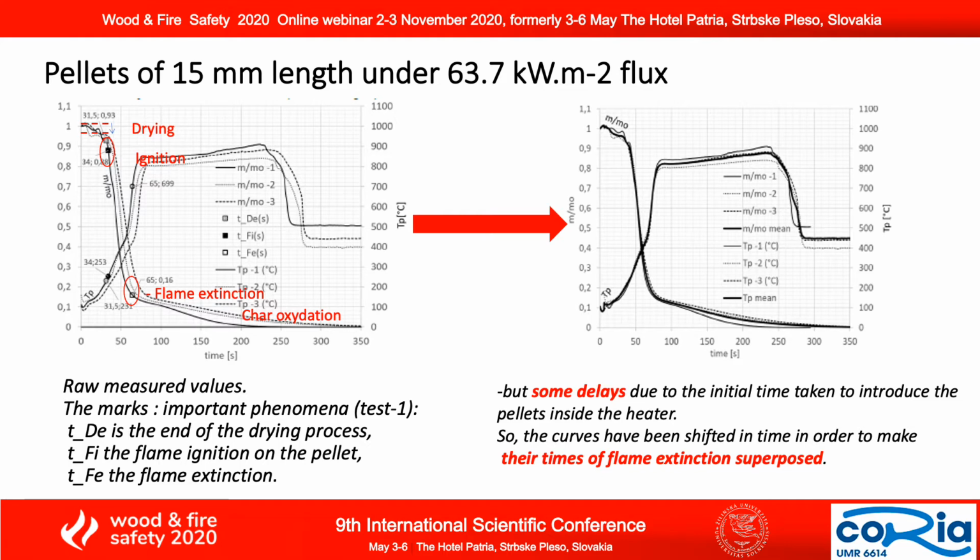However, we can see that the curves corresponding to the different tests are not superposed. There is some delay due to the initial time taken to introduce the pellet inside the heater. So the curves have been shifted in time in order to make their times of flame extinction superposed. And the result shows that now the curves are well superposed, indicating that we have a good reproducibility for the experimental set-up.